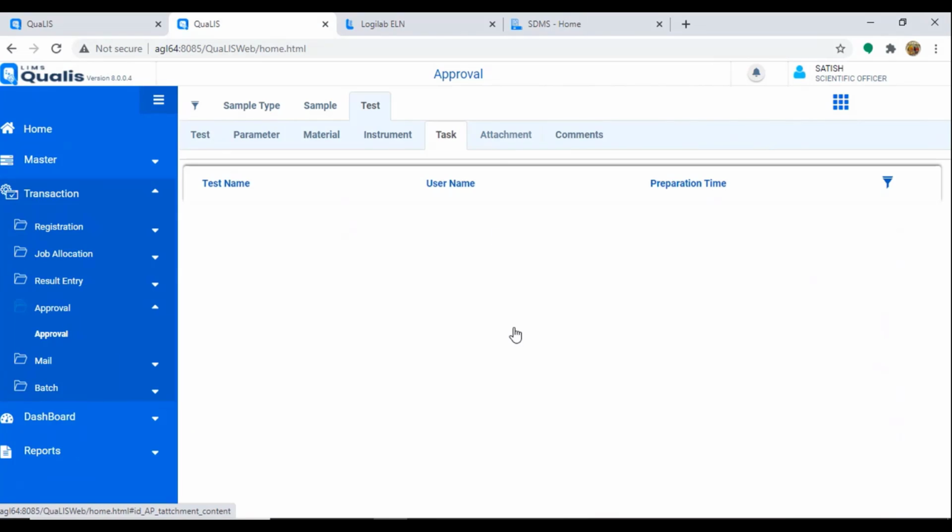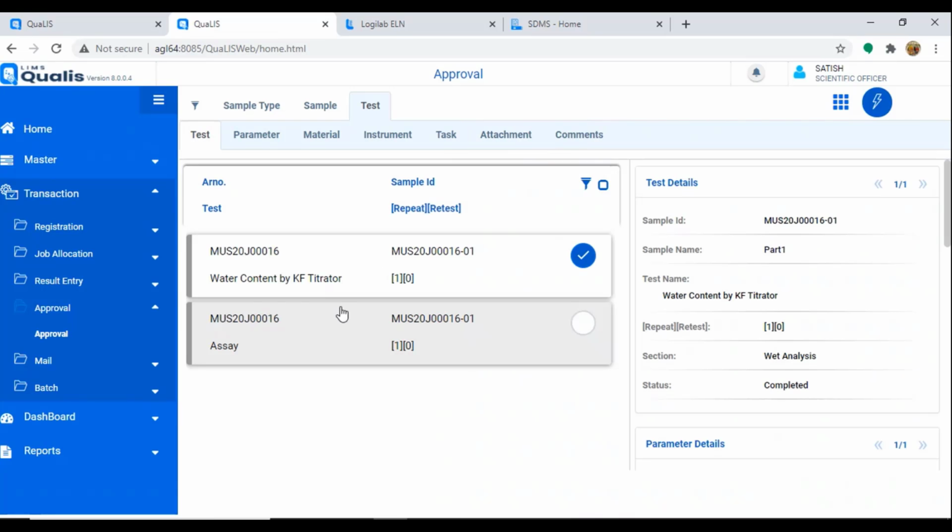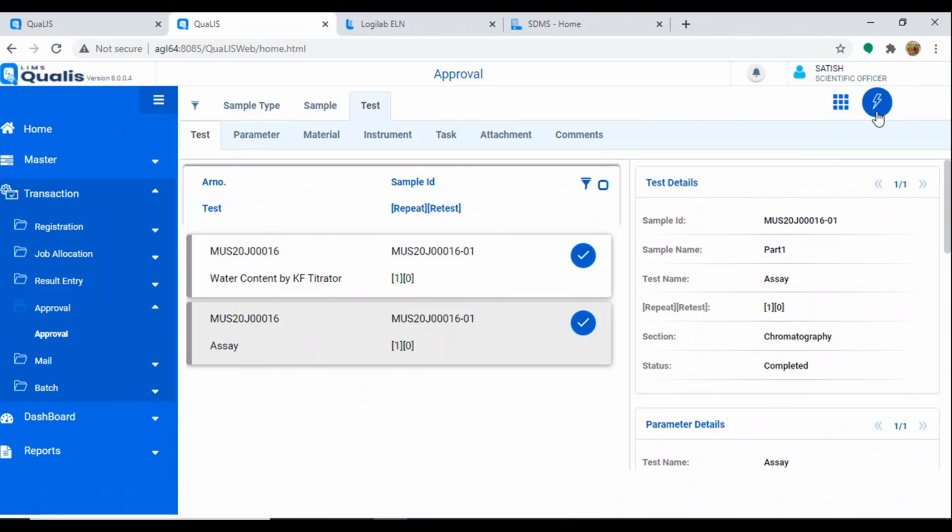Apart from that, he could have also attached additional attachments like chromatograms and pictures. The result sheet, the chromatograms, the pictures; in some cases a microscope will capture pictures as a result. All that could have been passed. Looking at all this information consolidated, I can take a decision on what to do. So I can say I review it.